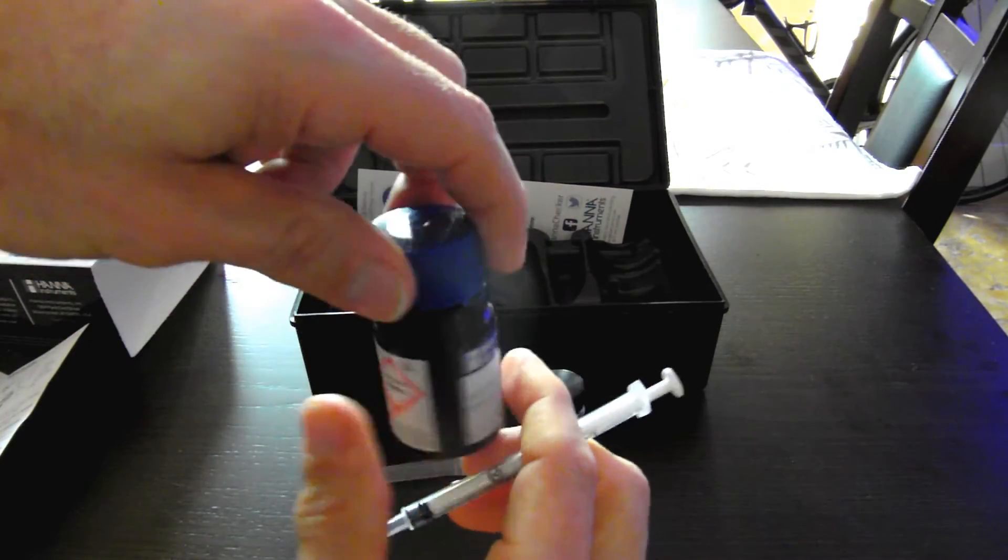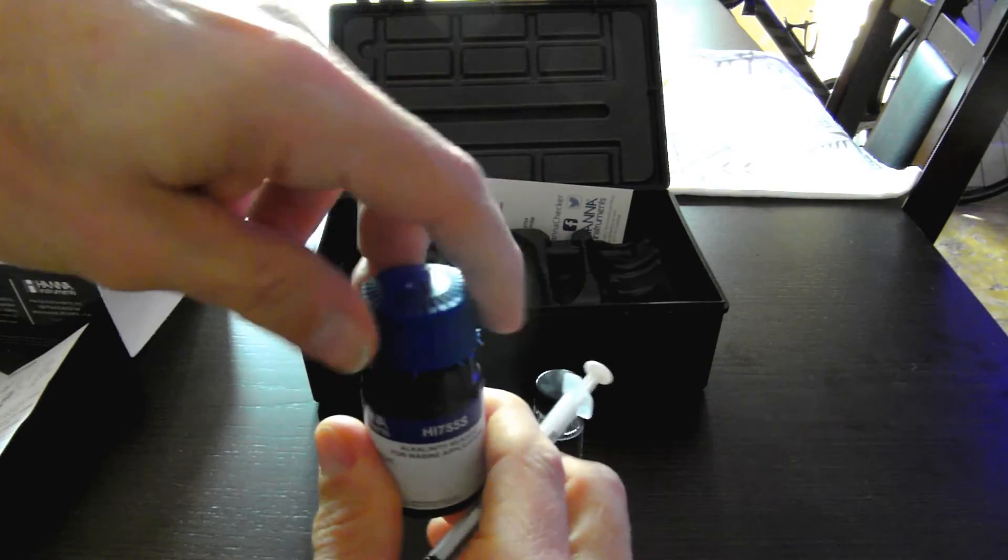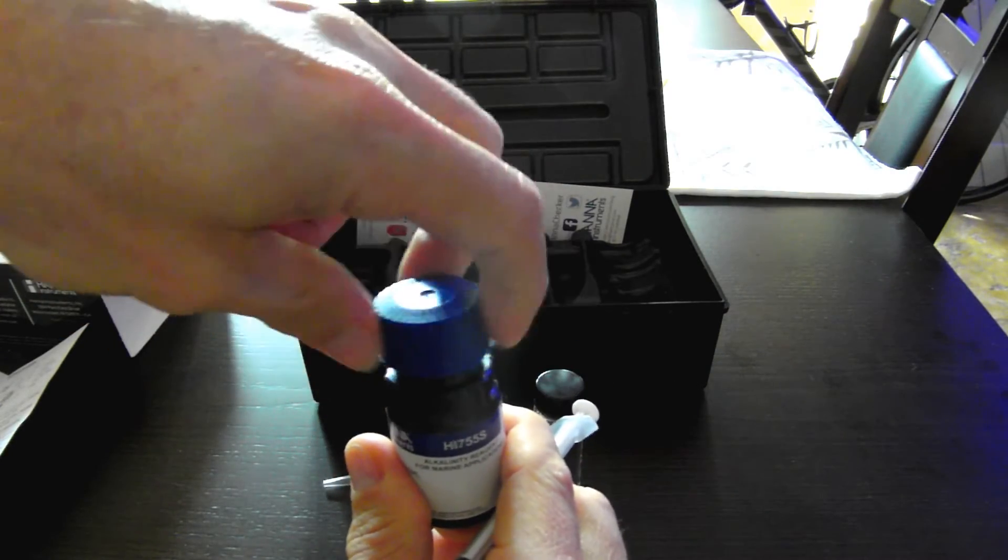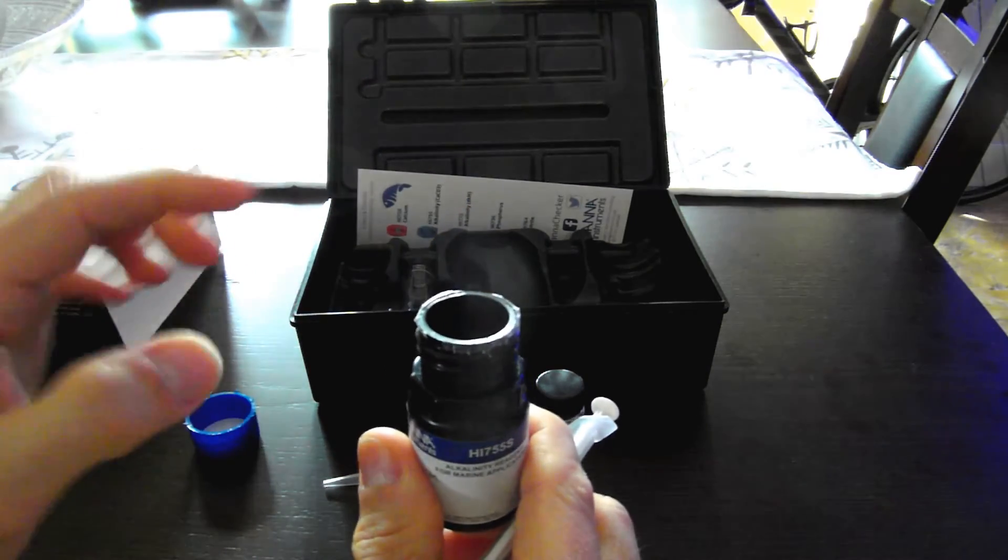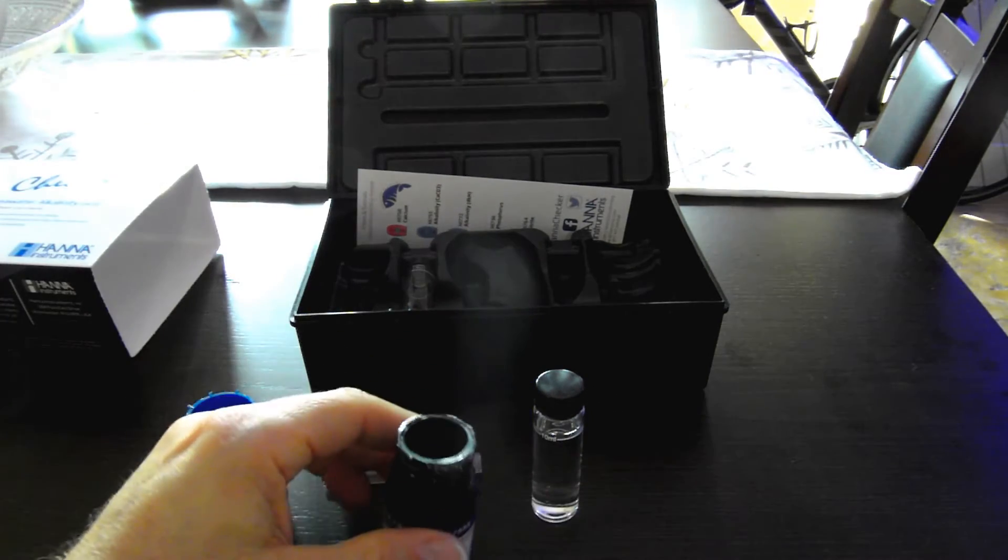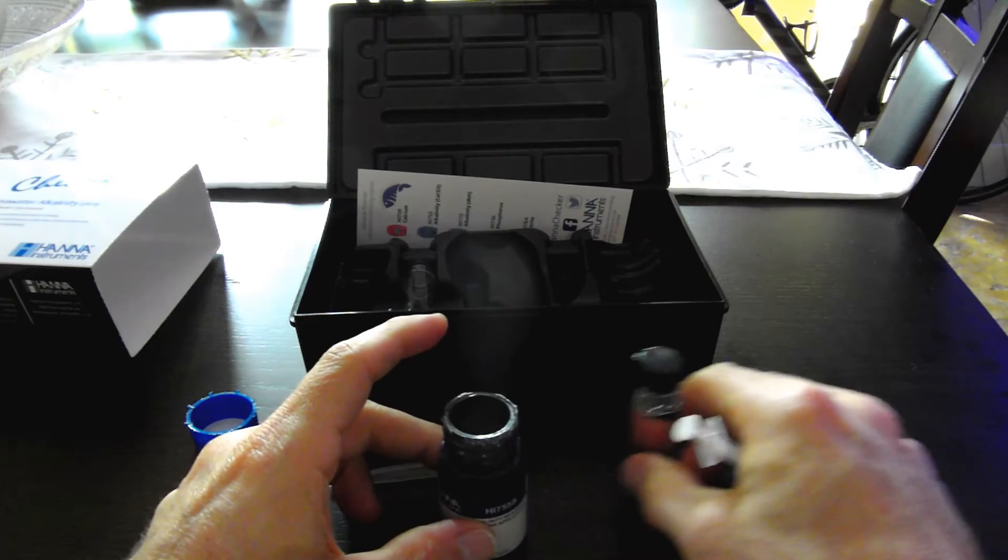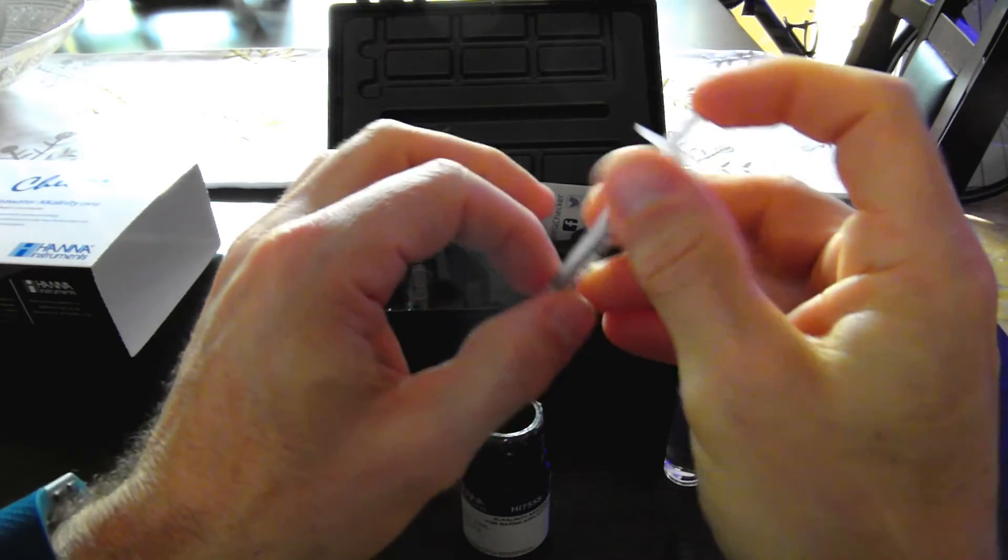Here's the new bottle of reagent. I had to remove the protective ring around the seal around the cap, and also there was some plastic right over the opening. I'll go ahead and draw in 1 milliliter.